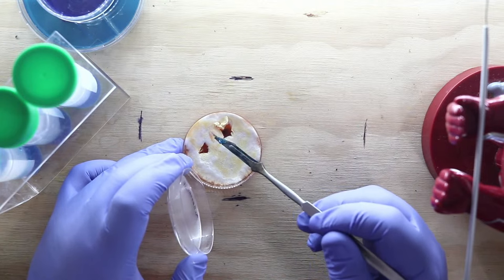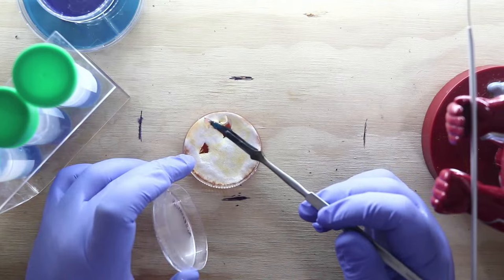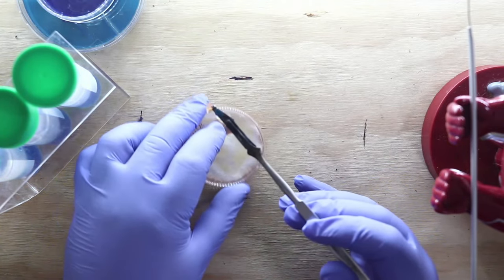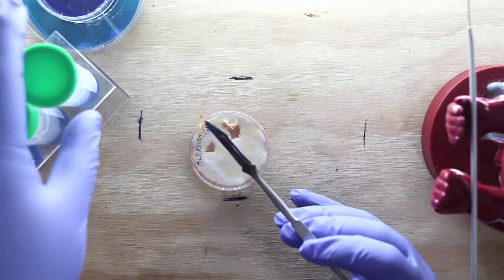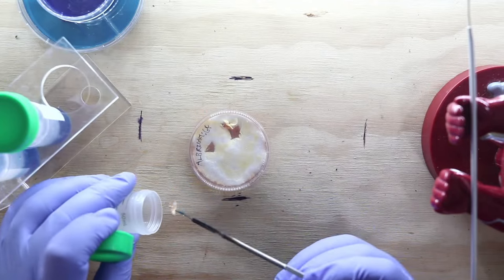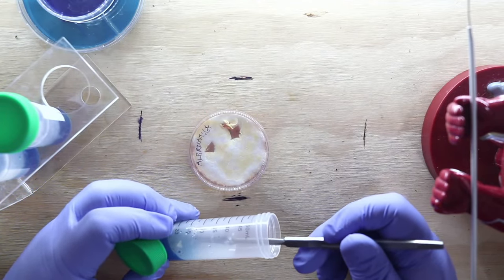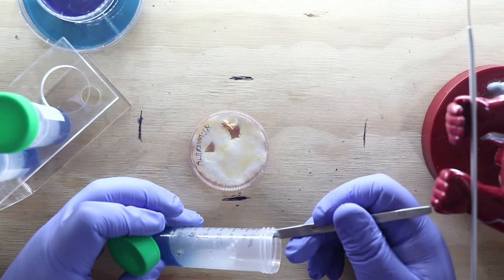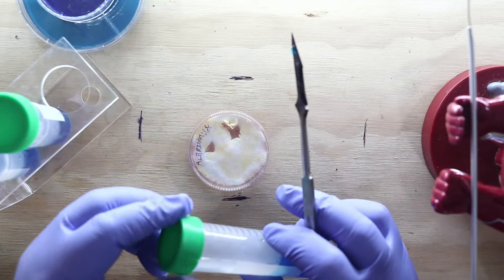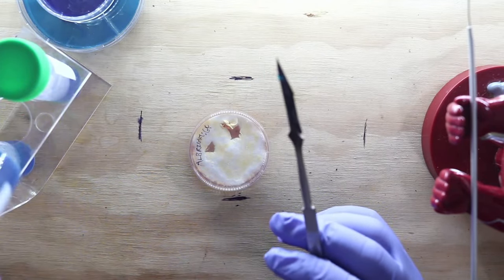Normally, guys, I would not. This is kind of bad practice, where I'm sticking my finger right here. I would normally not want to do that, but I'm in such a small space, and this dish is kind of wanting to slide around a little bit on this table, which is weird because it's not a slick surface at all. I'm having to hold it in a way I wouldn't want to. Set that back in there, cut through, draw out, close up, and I'll set that on the end.